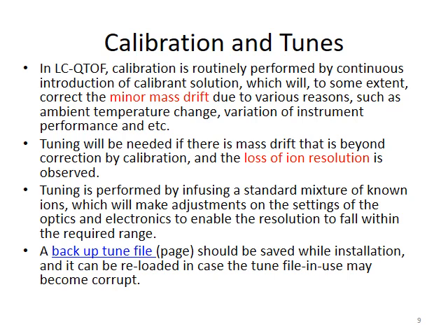To ensure not only a functioning QTOF, but also accurate results, it is also essential to perform calibration and tuning for your instrument. So, what is calibration and what is tuning? Firstly, both calibration and tuning are able to bring back mass drift due to some variation of your instrument performance.